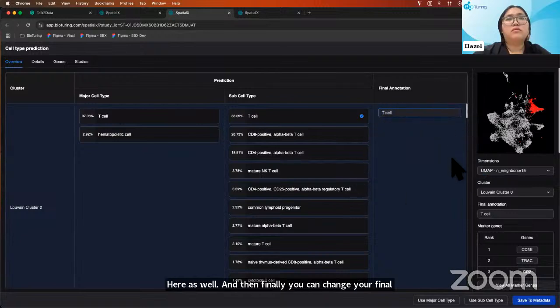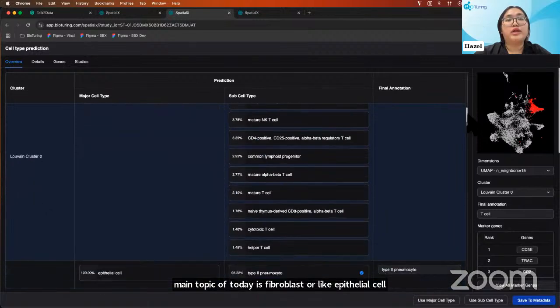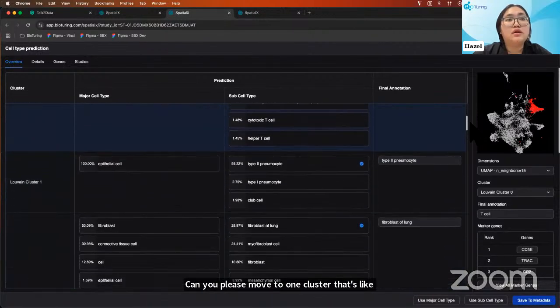Yes. Since the main topic of today is fibroblast or epithelial cell, can you please move to one cluster that's predicted as those cell types? Okay, yeah, like so here, right here.